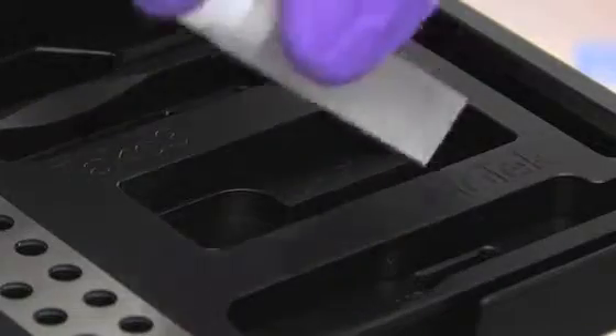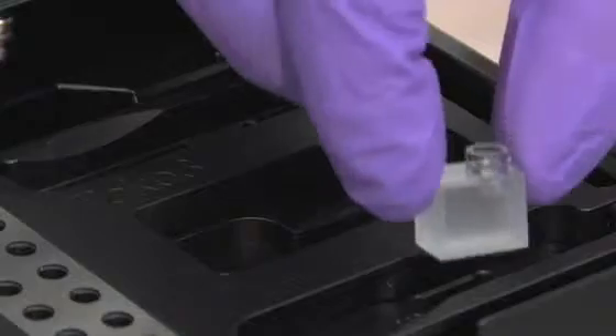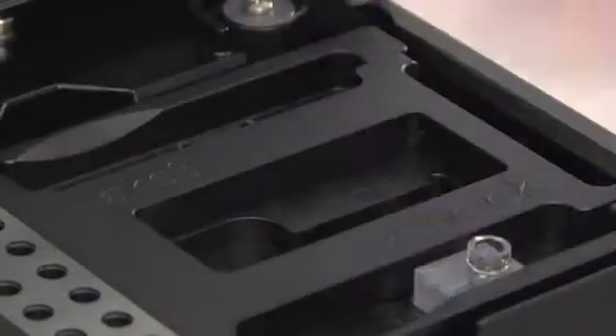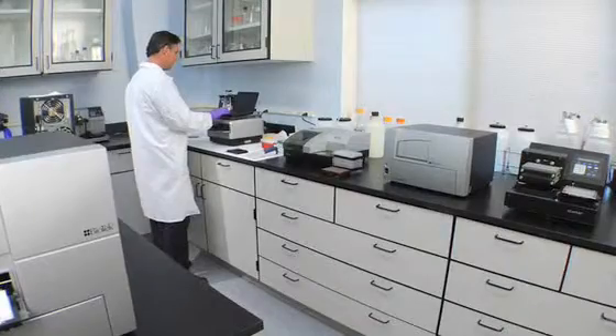The Take-3 plate and Epic Reader, used as a system, provides great flexibility to support all your laboratory needs, from low-volume nucleic acid quantification to biomolecular assays in 96-well plates.